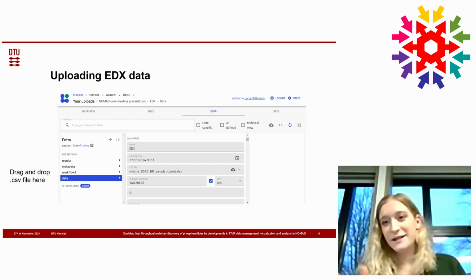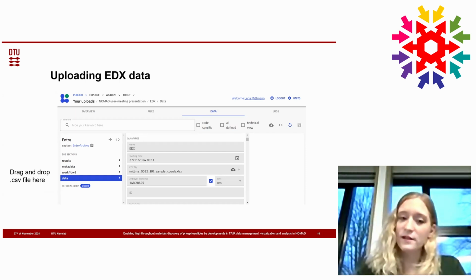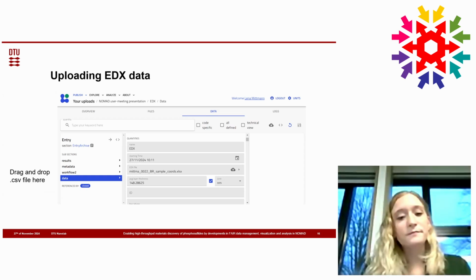The last thing that I wanted to show here is that we can not only do this for our process, but of course also for the characterization, because our work generates a lot of characterization data as well. And so we spent some time on, for example, creating a possibility to upload and visualize our EDX data.